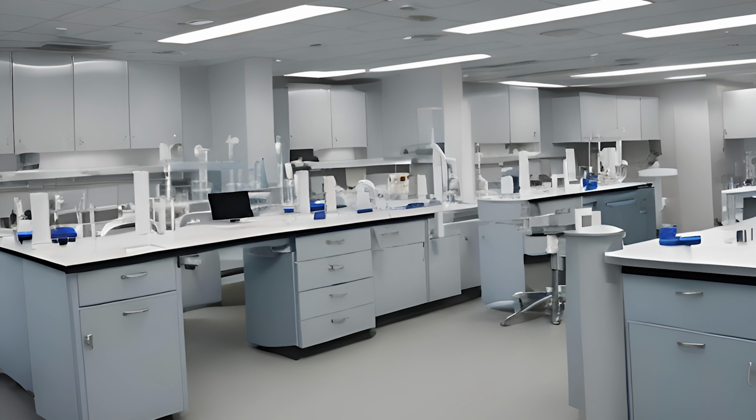If you're going to leave the lab, you take off your coat, you take off your mask and your gloves. And if you have long hair and you're working in the lab, you're going to tie that hair back. You do not want to lean forward and have your hair dip down into an open tube of sputum. That is mucus, that is snot that someone coughed up out of their lungs, and now it's in your hair. You don't want that to happen.